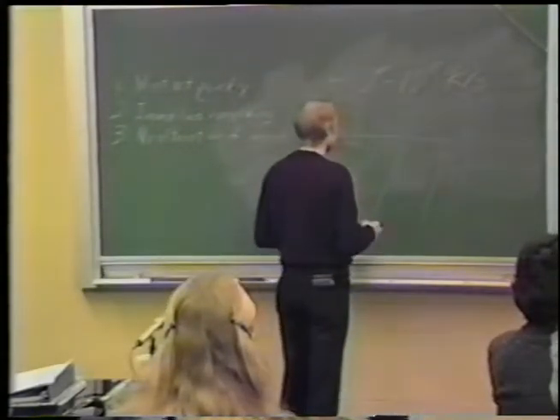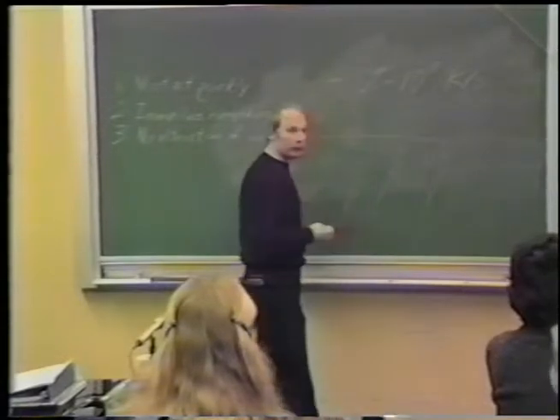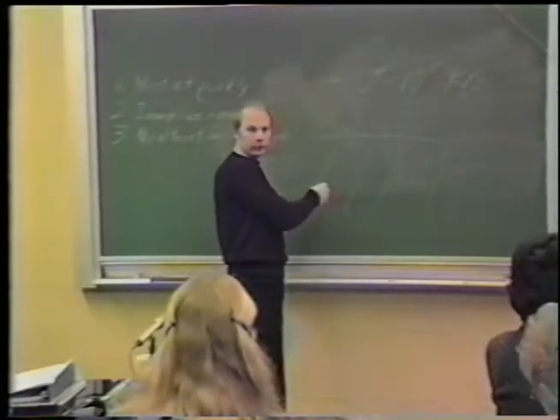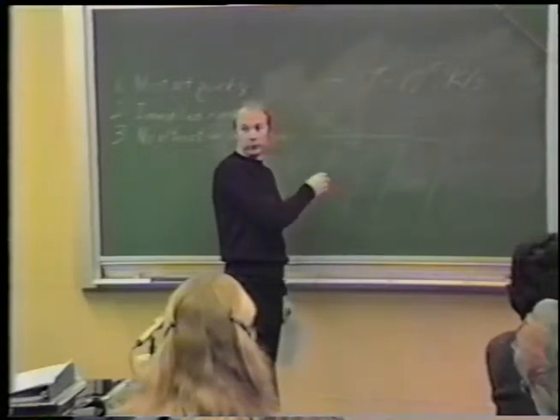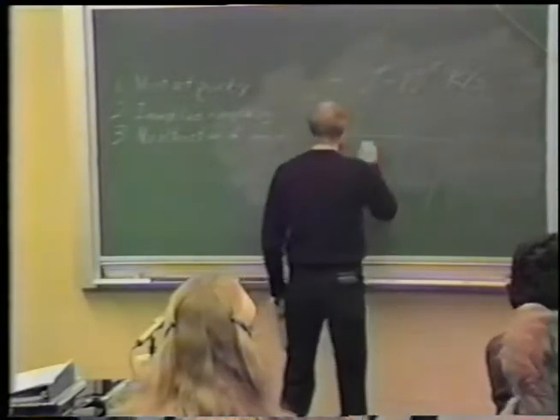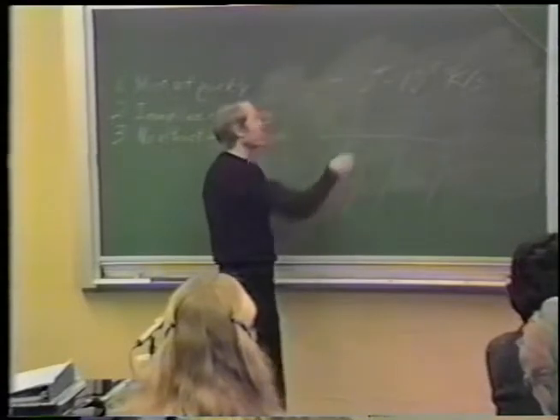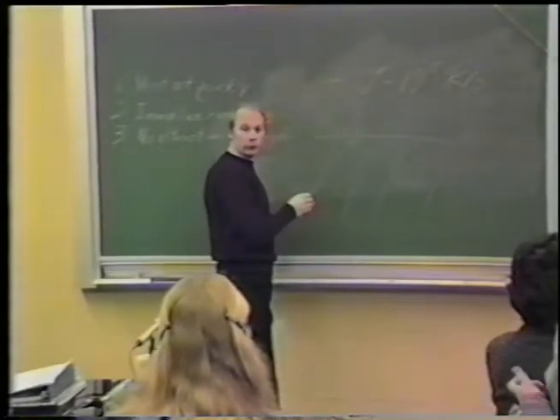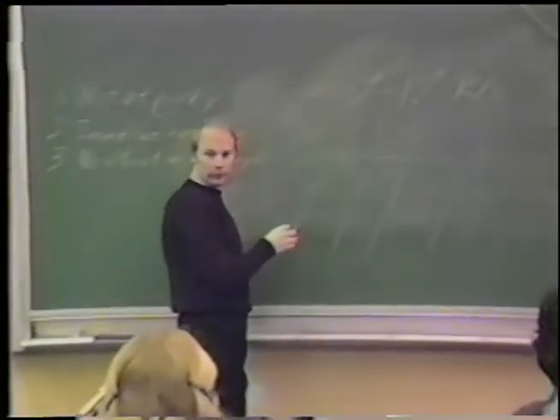That means that we're severely limited in the depth to which ultra-rapid freezing can be obtained in a large sample, because the thermal conductivity of water is pretty low. And at some point in the sample, you aren't going to be able to withdraw heat quickly enough to prevent early nucleation of ice crystals and their growth.